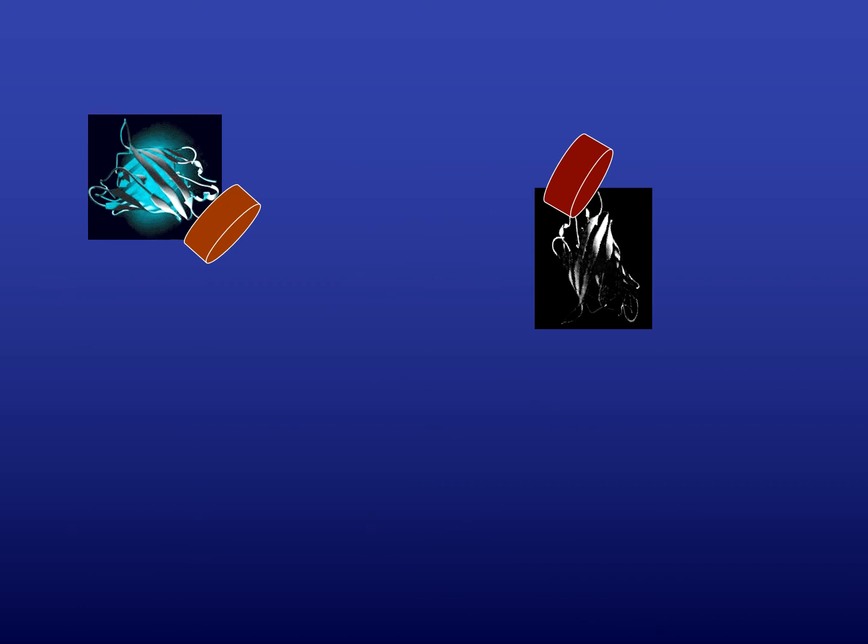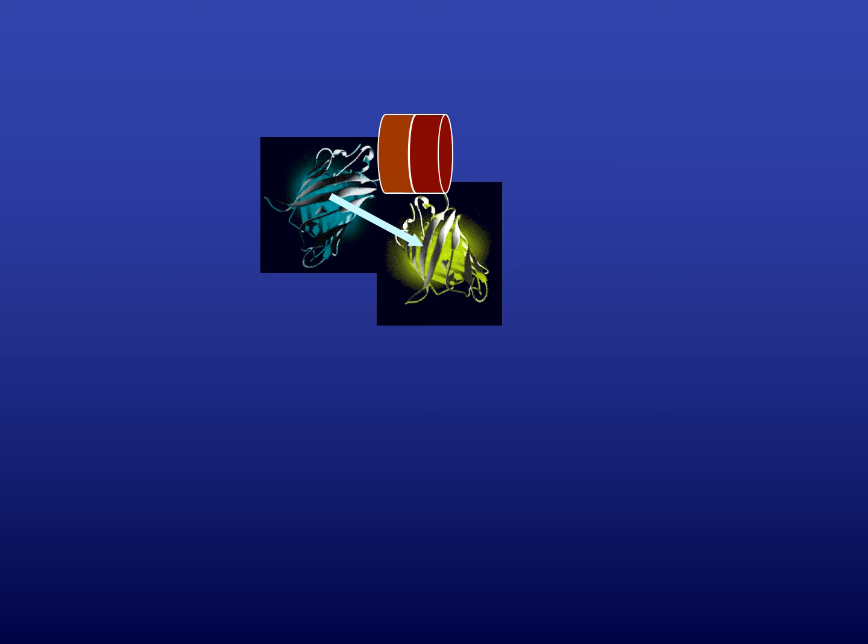Here you see graphically, for example, a cyan molecule on the top left, and it has some binding partner that it is fused to, and now a second molecule that is typically dark because it's not excited by the blue light. However, if we now make them bind, and that doesn't mean that the GFPs bind, but rather these molecular parts that have an interaction site, so they make these two proteins bind to one another, and because the fluorophores are dangling off the same molecules, you now suddenly get this sensitized emission from this molecule. So here this could be YFP, for example, yellow fluorescent protein.